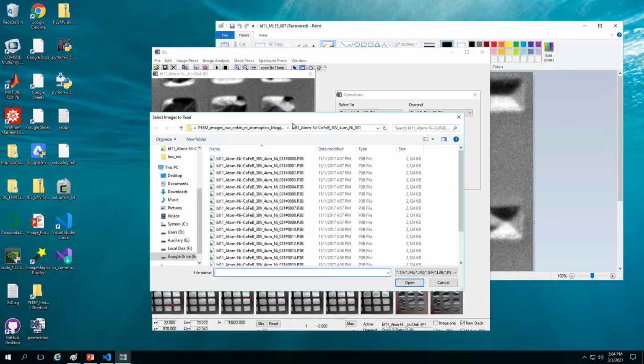To do the low image, you need to think about it. We take 10 images for one polarity and 10 for the other. Then you take two images from the first 10, and two images from the other 10.